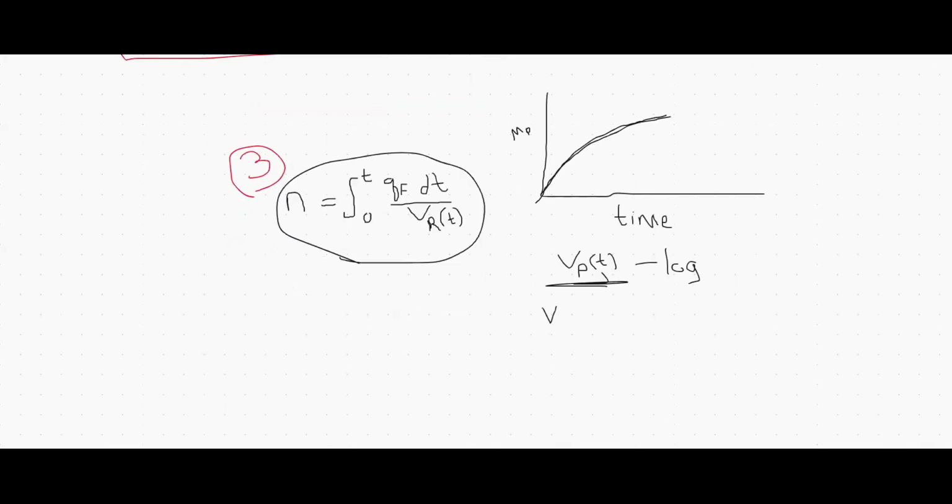And then of course, our V total minus the permeate volume over time gives us a retentate volume over time. Okay, so then with this expression, I can integrate it again using some packages available in Python. I have the QF, and then I also have the time of my concentration steps or my diafiltration steps, and I can calculate the number of pump passes.